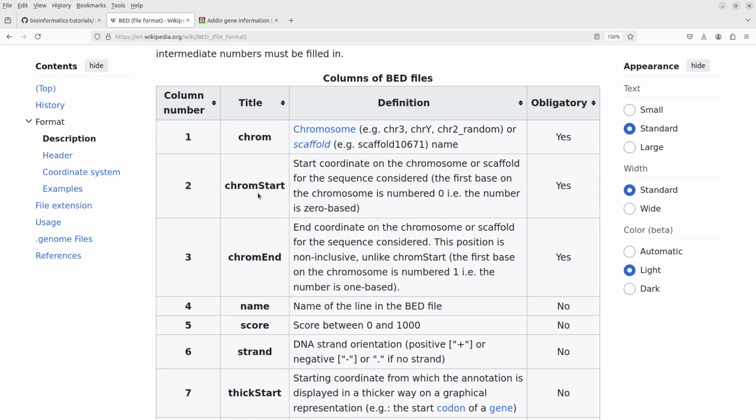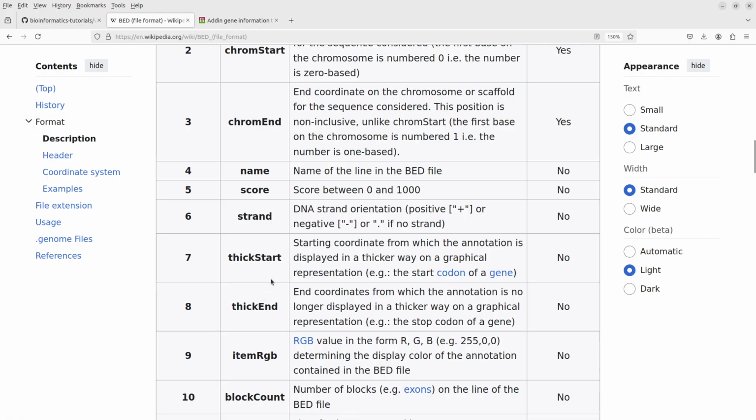Let's say the chromosome has a length of 1 MB. All right, now which part are you representing? Or let's even use an absolute number. Let's say the chromosome length is 1000. Okay, which part are you representing? So if I'm representing, let's say, region 100 to 200, then the chromosome start is 100, chromosome end is 200. So these three are mandatory. It's important to always include them. Then you add the other information: name, score, strand, and so on.